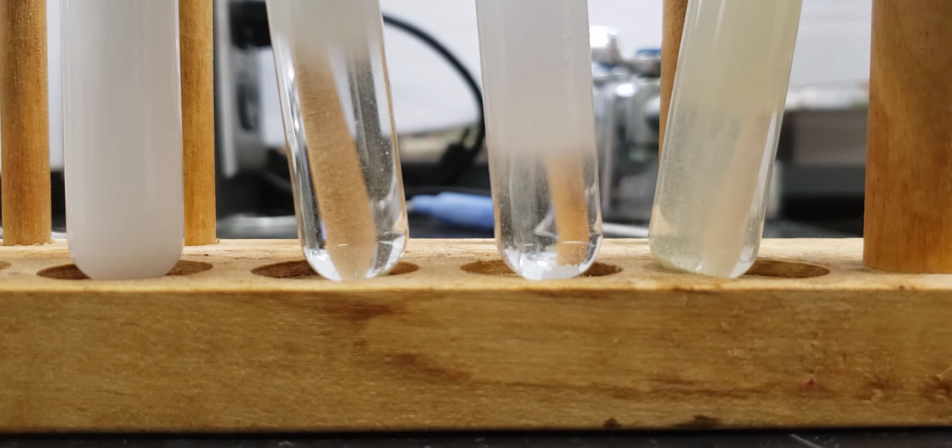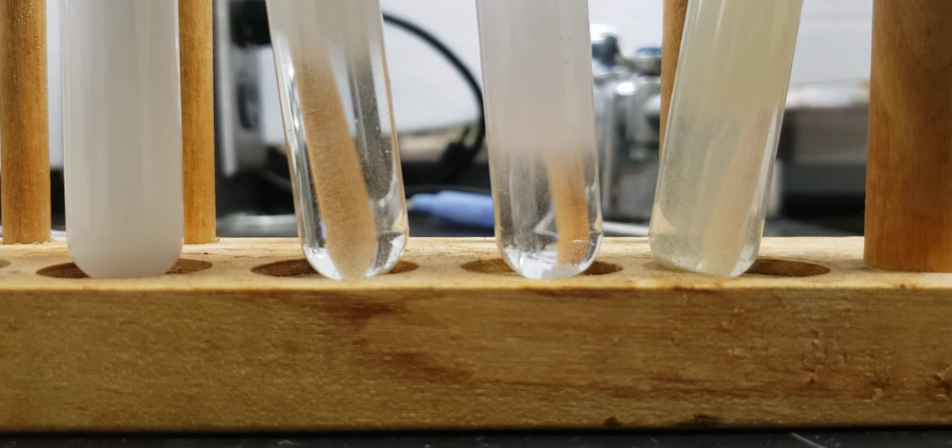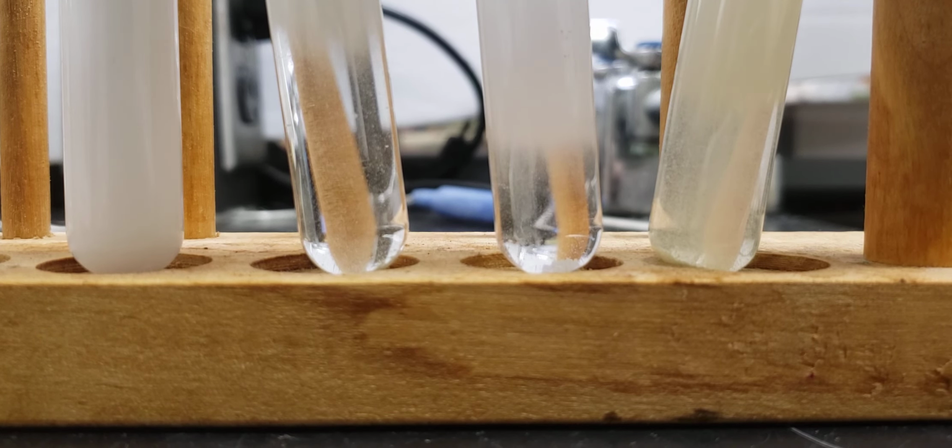Okay. The rest of the test tubes you're going to have to evaluate on your own to see which test tube has which kind of halide ion. And at this point, I'm going to go ahead and close out this lab portion, because you should have all the information you need to finish the lab for today.